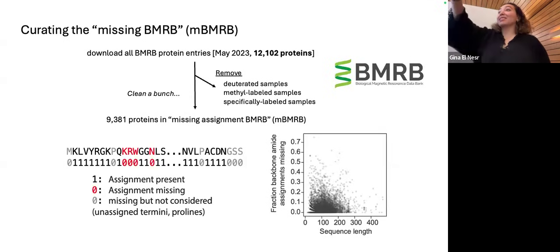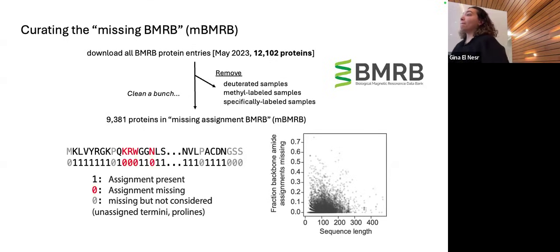How good is the assumption that missing residues are solely due to exchange broadening? The complete assumption, we had a good amount of predictive power on this, and that predictive power actually corresponds with other forms of NMR experiments, and I'll talk about all of that and the evidence we see there.